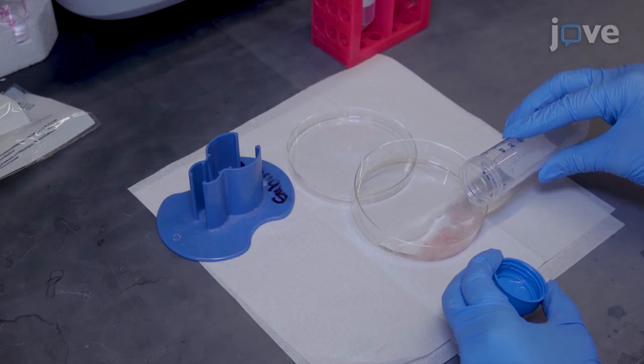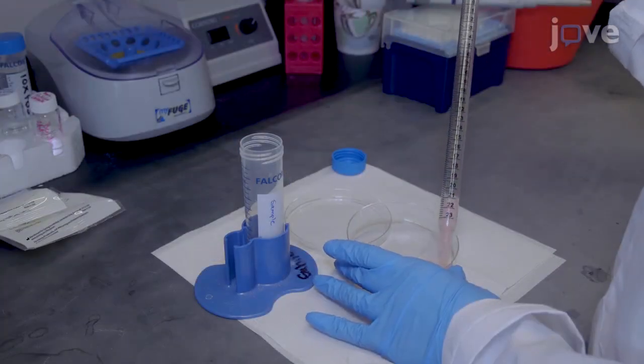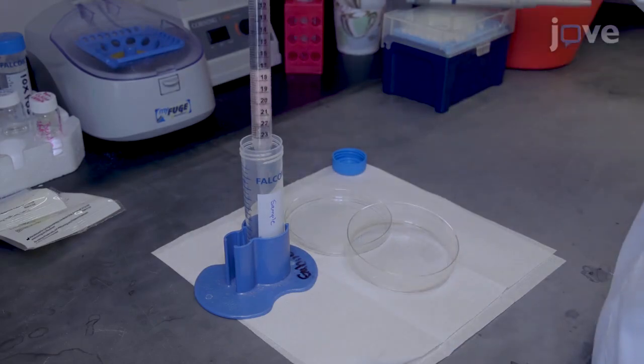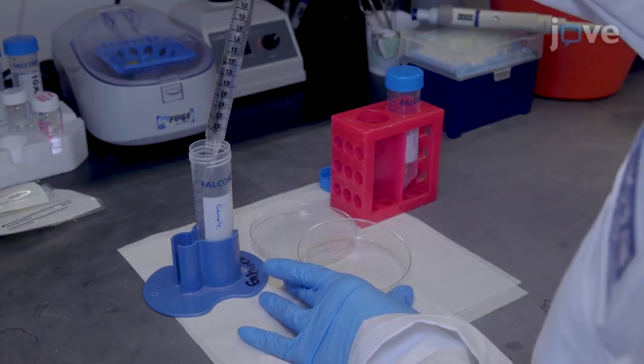Add about half the amount of prepared digestion buffer to the minced tissue and use a serological pipette to transfer the sample to a 50 milliliter centrifuge tube. Wash the dish with the remaining buffer and add it to the 50 milliliter tube.